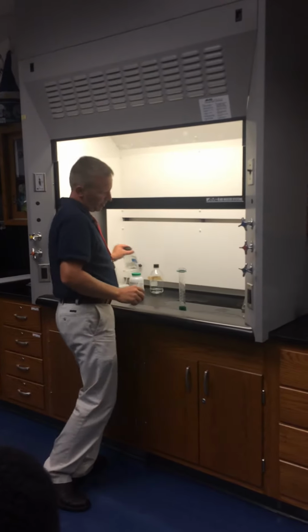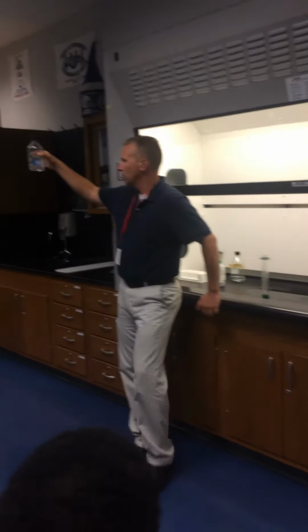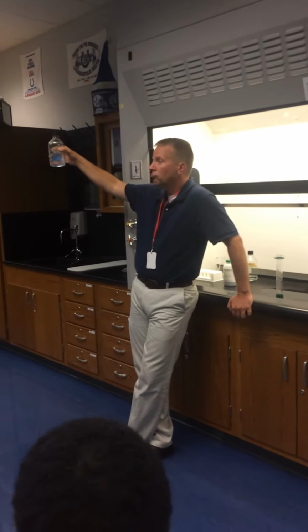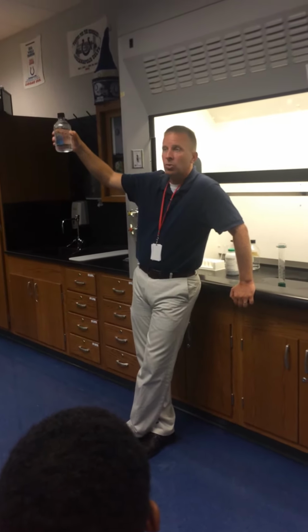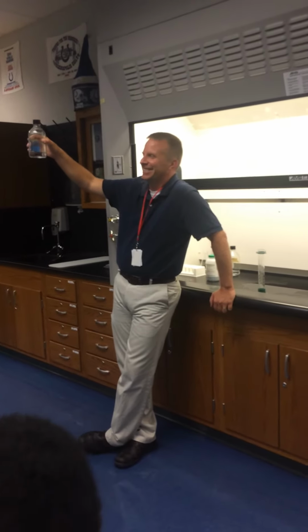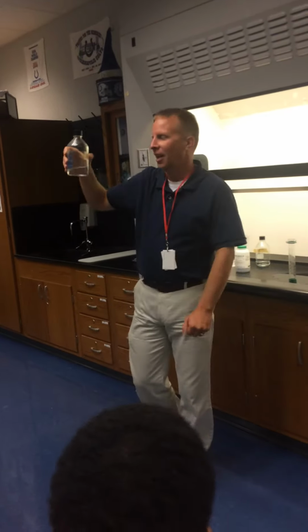The first thing that I'm going to show you is the stuff that is in this container right here. Anybody want to take a guess? Alcohol. Water. I wish it was water. I wish it was alcohol. No, we don't need alcohol. Sweat. That was a good one too.